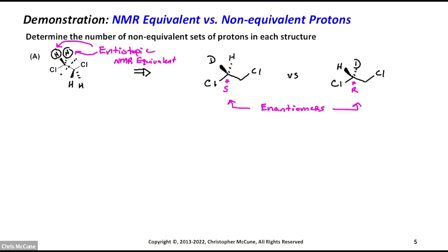Okay, let's do one more thing. Let's compare another set. Let's compare this hydrogen to that hydrogen. So I'm going to replace again and compare the structures. And I just do this for any hydrogen that I'm really having trouble questioning. Maybe it's not easy to see. Maybe it is. That's up to you.